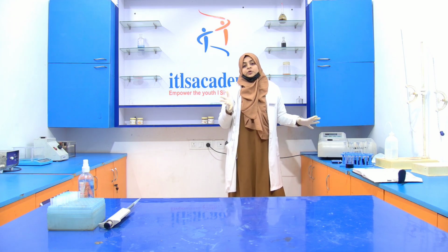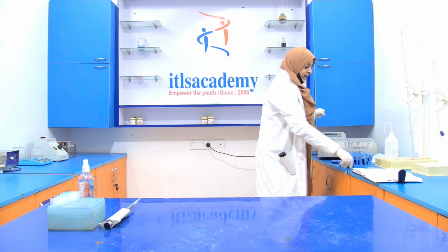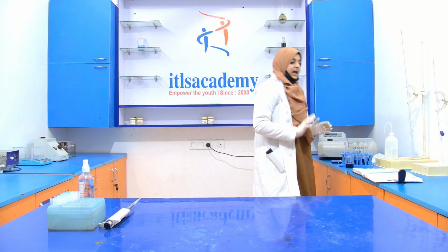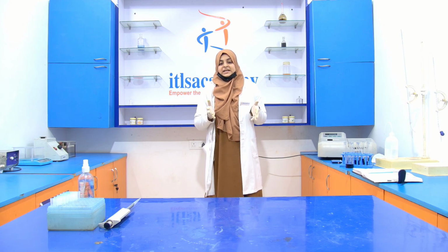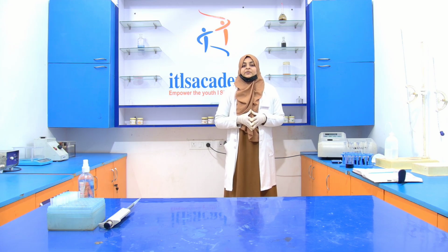Every time you have to ensure that the opaque side will be in front of you. Okay. And the transparent side will be this side. Okay. Now take the reading. It is around 0.016. Now you note down all the readings, and after noting them down, we have to draw the graph between the absorbance and concentration of the BSA. Then with the help of these formulas, we calculate the concentration of the protein present in a soft drink.